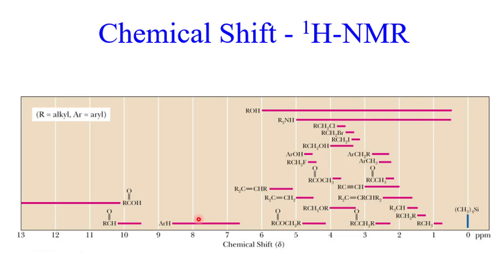Sir, actually for proton it is 0 to 10, but we actually provide proton NMR data from 0 to 13.